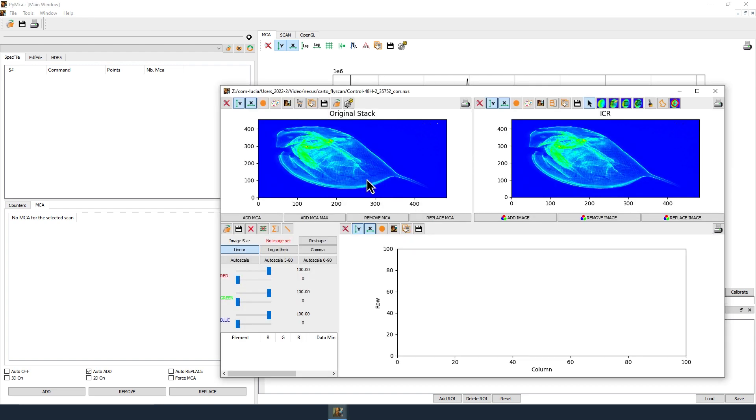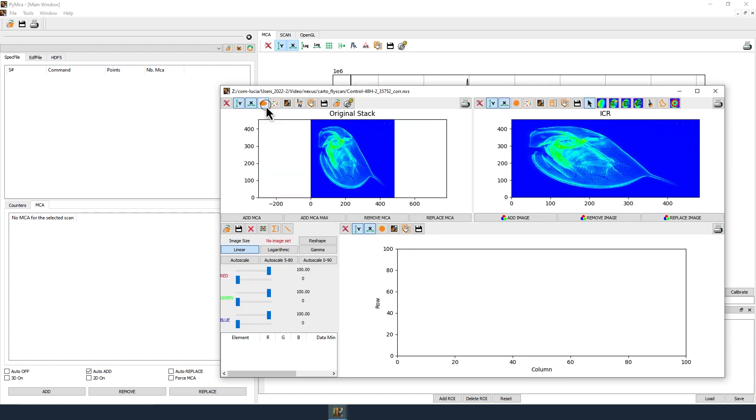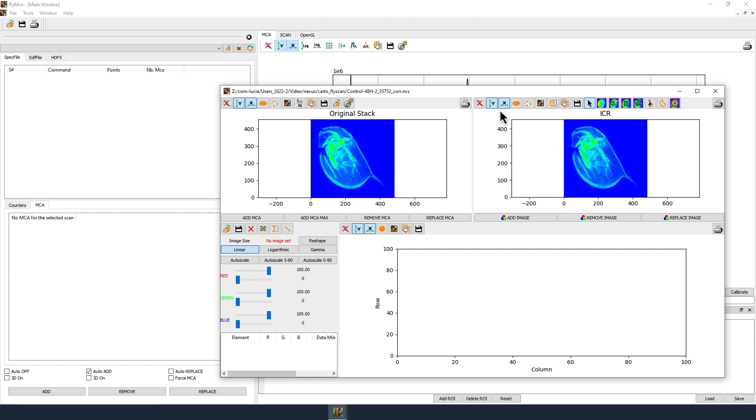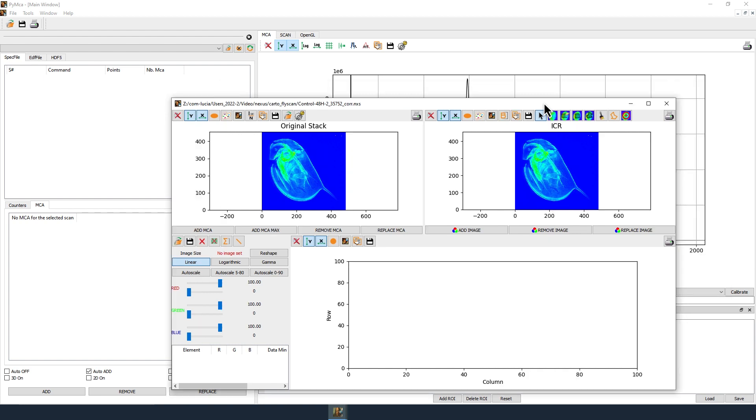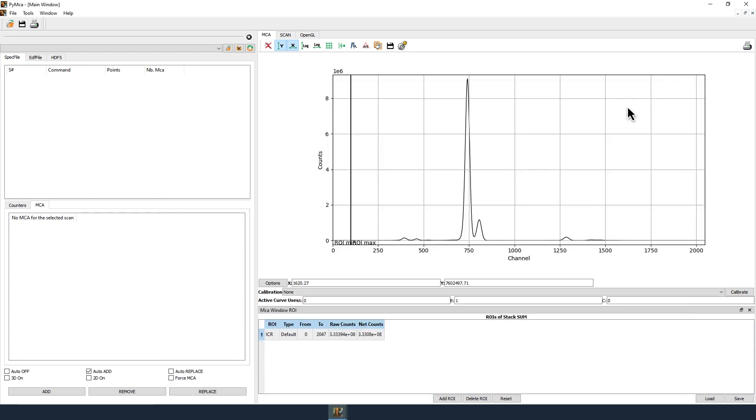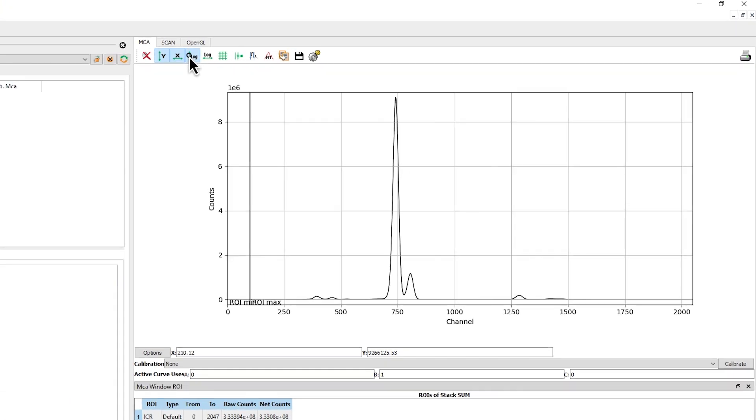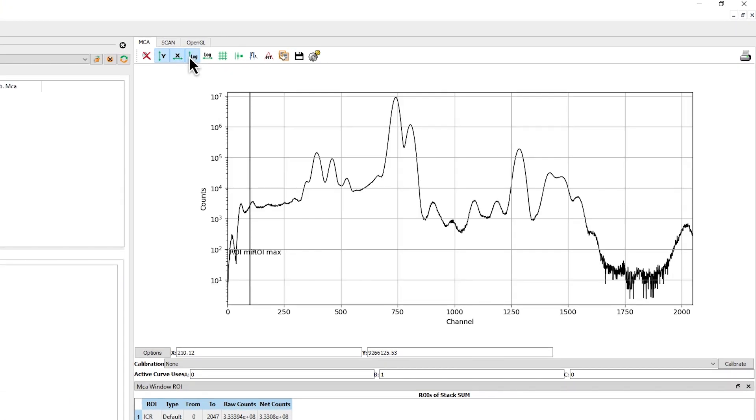You can use the orange disk icon to display the map with the right XY axis ratio. Click on the Replace MCA button to display the XRF sum spectrum in the main window. In the main window, you can display the XRF sum spectrum with a logarithmic scale by clicking on the toggle logarithmic y-axis icon.